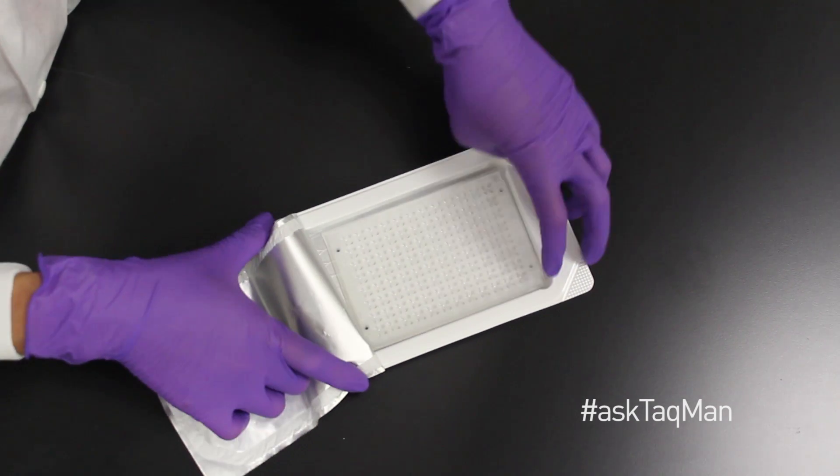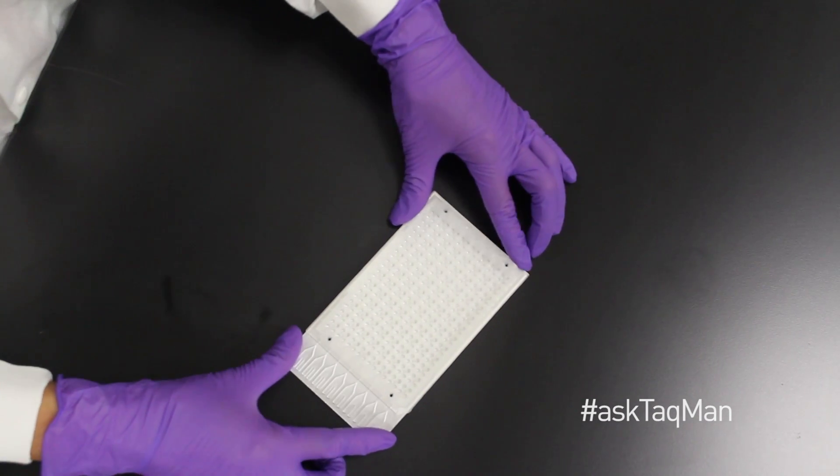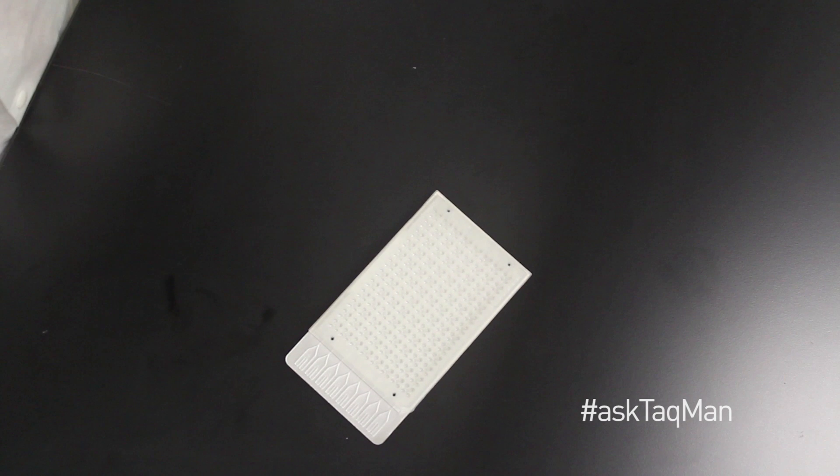But for a larger project, we'll need to look beyond this. Using assays in 96-well plates are pretty familiar to all of us, but what about the other format options? This is a 384-well microfluidic card. It has eight loading ports, so depending on the assay layout, you can run from one to eight different samples on one card. The port is loaded with 100 microliters of sample and master mix, then centrifuged. This forces the sample into the individual wells, which are around one microliter each, and contain a pre-spotted TaqMan assay.